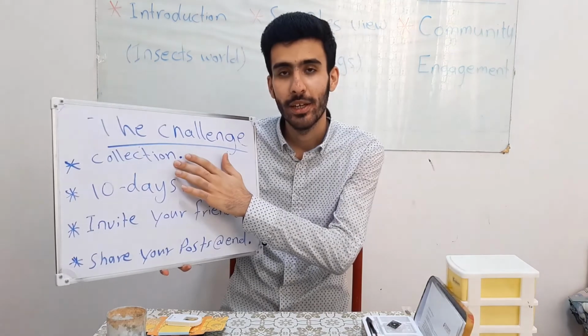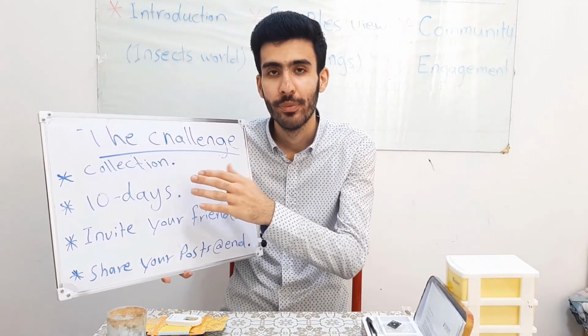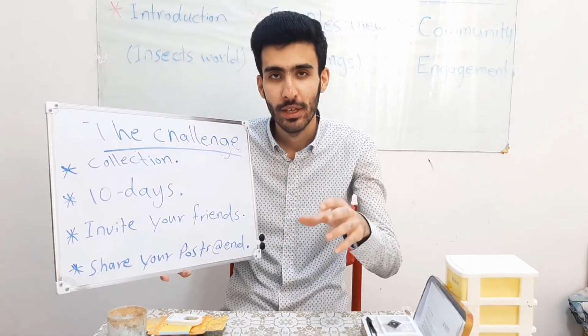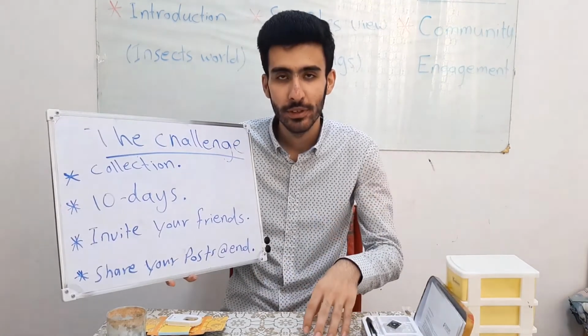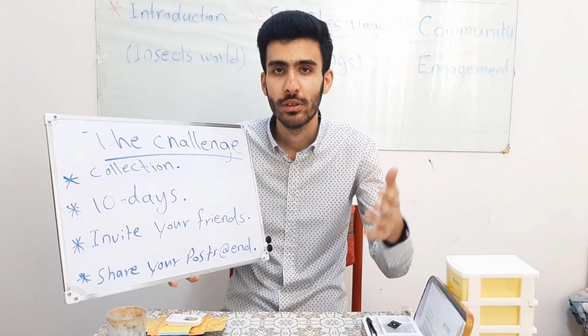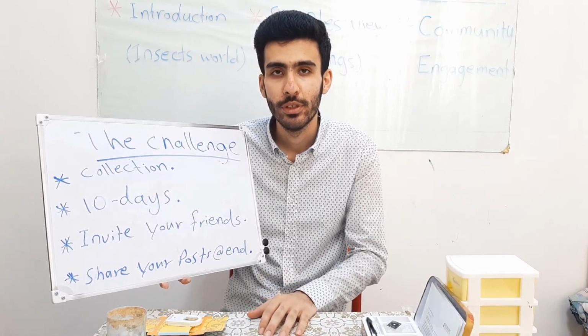I am inviting you to make a collection of an interesting topic for you, and decide to take the samples and make experiments for 10 days. So you make a commitment for yourself, and at the end of the 10th day you will share these samples and document them in the Foldscope community.